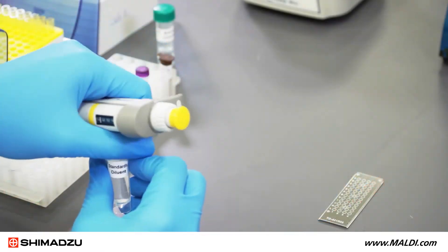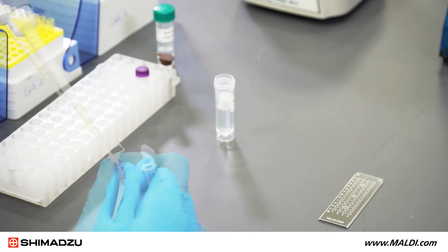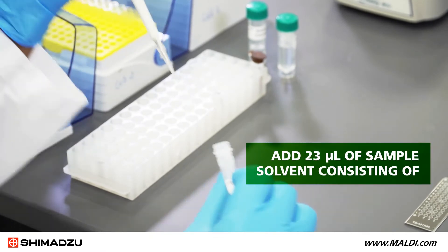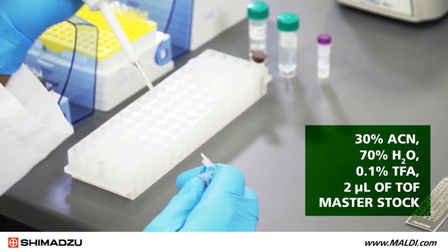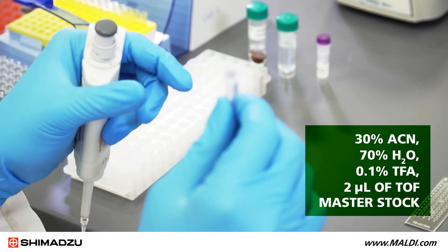For the sample solution in this demonstration, we will prepare a working stock of TOF QC Standard from the LaserBio Labs Kit. In a new tube, add 23 microliters of sample solvent consisting of 30% acetonitrile, 70% ultra-pure water, and 0.1% trifluoroacetic acid, and two microliters of TOF master stock.